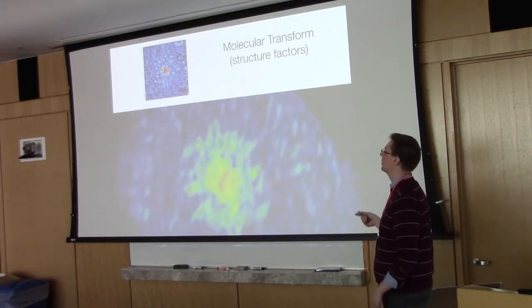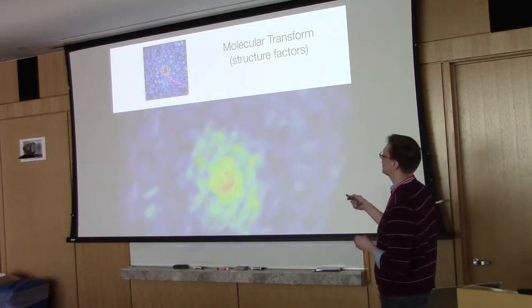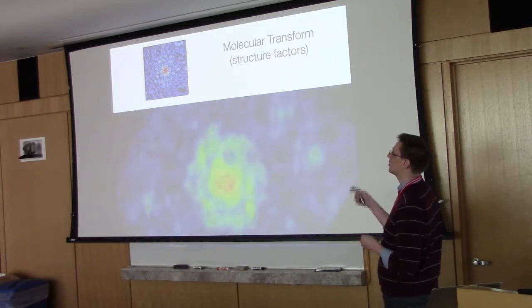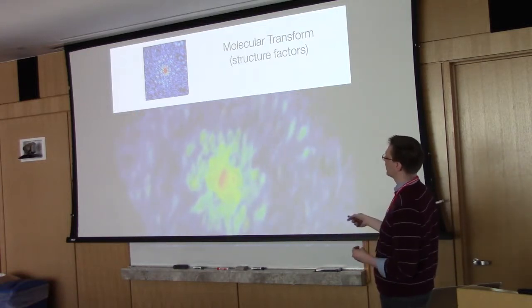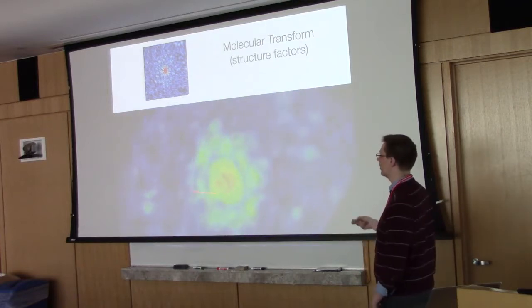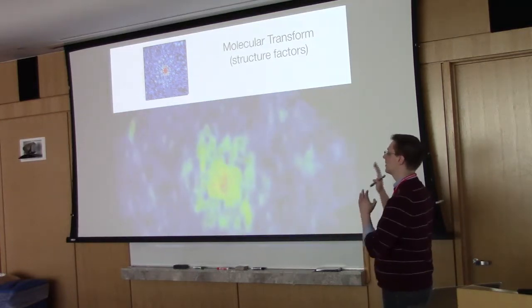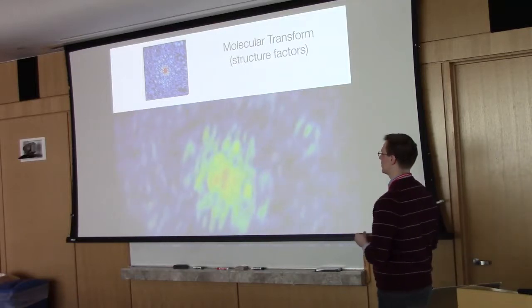Okay, so I alluded to this earlier, but this is a 3-dimensional representation of reciprocal space, okay? So this up here is that image I showed earlier, and this is a 2-dimensional cross-section, a slice of the Ewald sphere through this 3-dimensional reciprocal space, okay? So this 3-dimensional reciprocal space is unique to the structure of your biological molecule, okay?